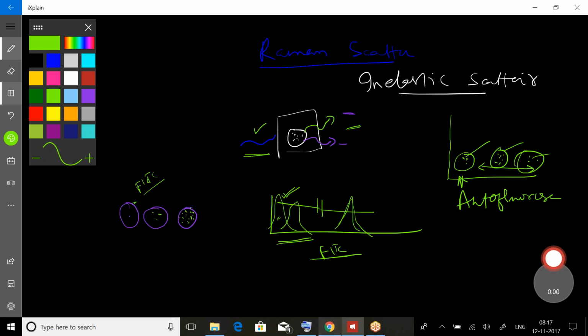And we can use multiple different fluorochromes simultaneously. That's how by flow cytometry we can study a large number of parameters. The current flow cytometers can go as high as 30 parameters on fluorescence, but that's not the limit. New flow cytometers are coming up now, and the technology is still developing.